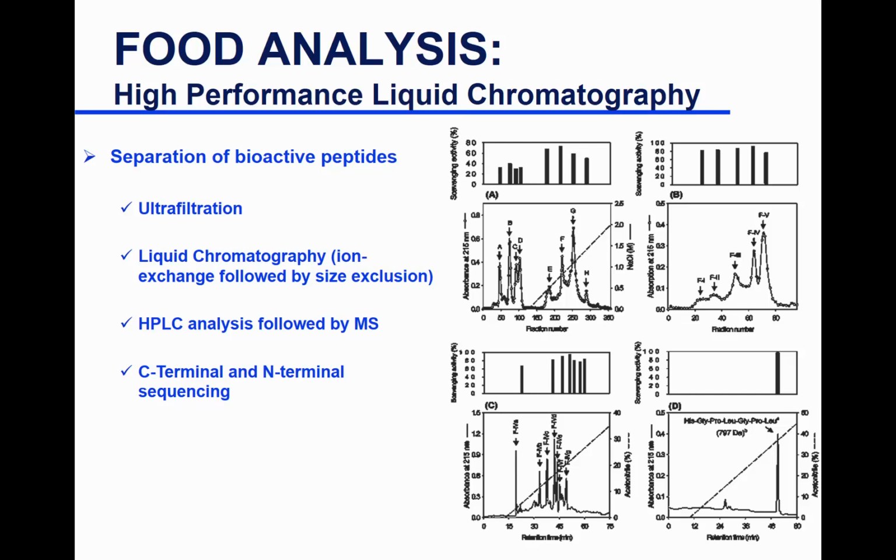I take that and I run reverse phase chromatography to get even more specific interactions. So you might have two peptides with the same molecular weight and the same charge, but they are still co-eluting. So you run reverse phase, and then you collect the fraction that has the highest activity, attach it to the MS, and you can do a stepwise MS detection and get sequencing of your peptide.